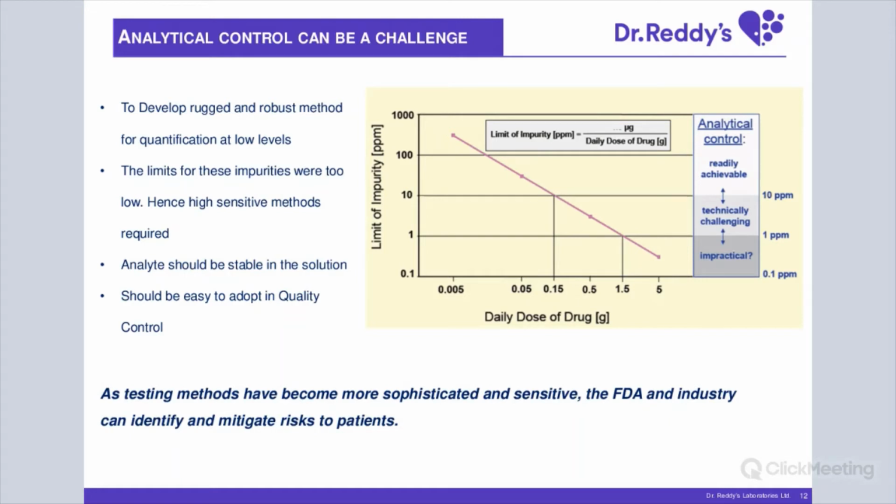For example, in one of our manufacturing facilities, we are making a huge tonnage of one API. We have recently done 300 batches very successfully, and ensured that the potential nitrosamine which is expected to be present is less than 30% of the threshold specification limit.